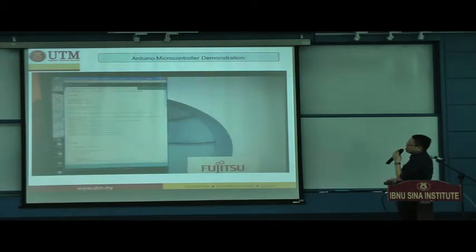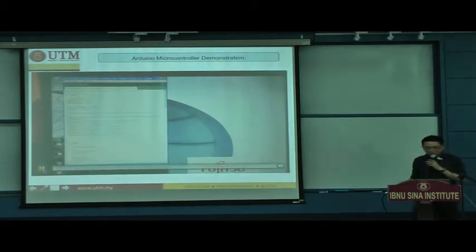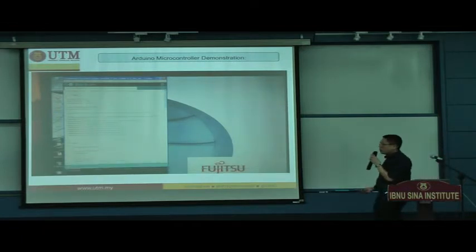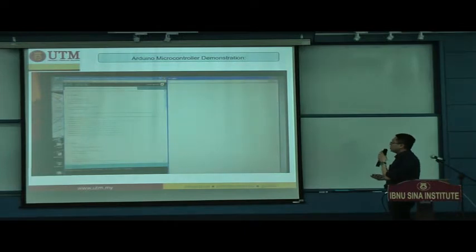So this is the software that we developed. Yes, it's very easy to automate the experimental procedure. Because right now the technology is so advanced, I had no idea about this before, but it's so simple that you can control it using a USB from your laptop, and then using a small controller box to control any instruments that you would like.